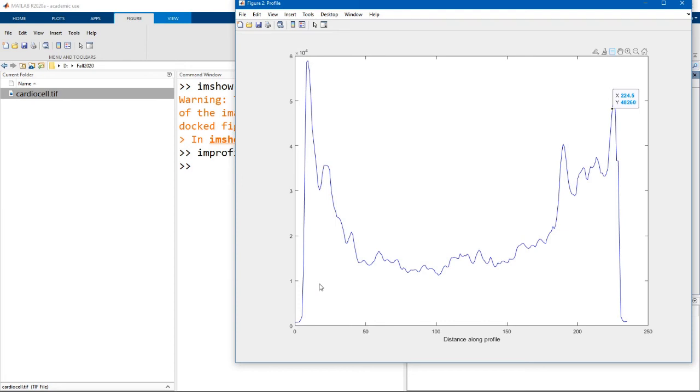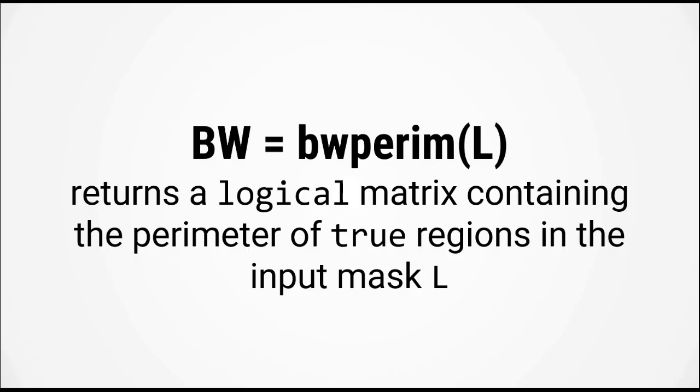In our example, we picked the value of 10,000 and you can see that that is below the intensity of any pixels in the cell.